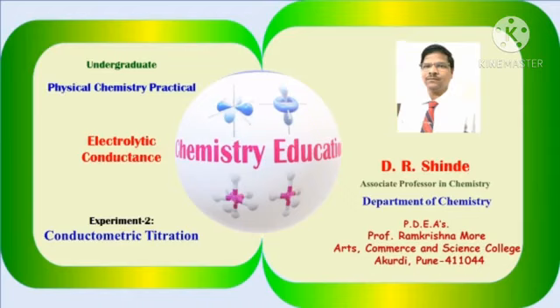Dear students, due to the COVID-19 situation, you cannot attend the laboratory experiment. Through this video, I am trying to bring a real laboratory experiment to you. So, watch the full video, record the readings during the experiment and perform the calculations.